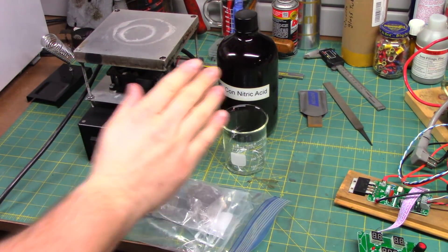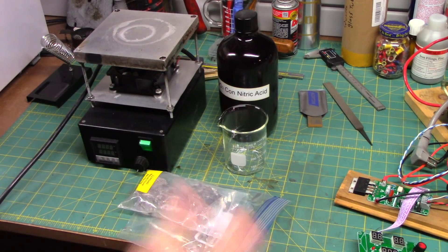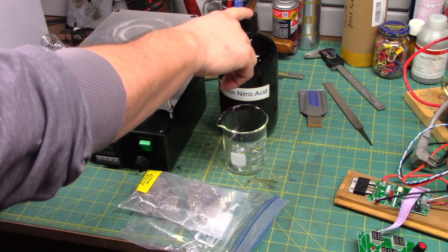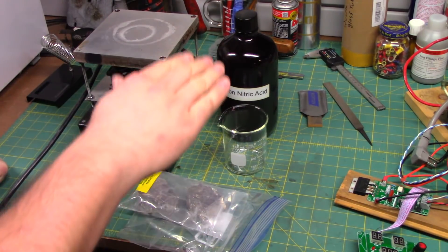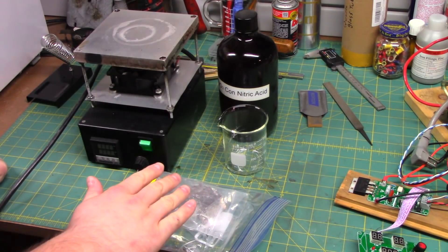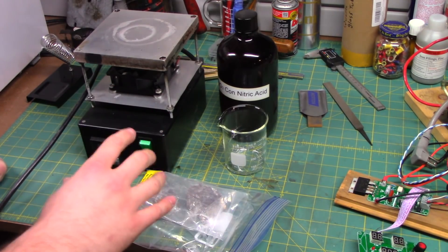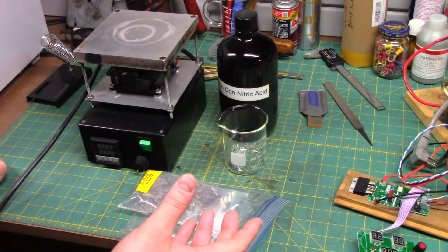So, the game plan. Convert this elemental bismuth into bismuth trioxide. And basically we're going to do that, dissolve it in concentrated nitric acid, boil that down into pure bismuth nitrate. And at that point we will thermally decompose it into bismuth trioxide.